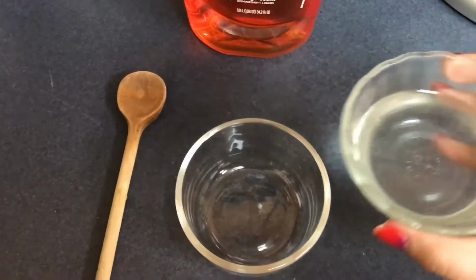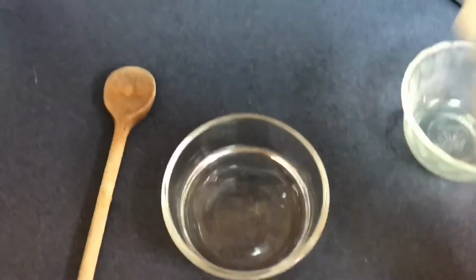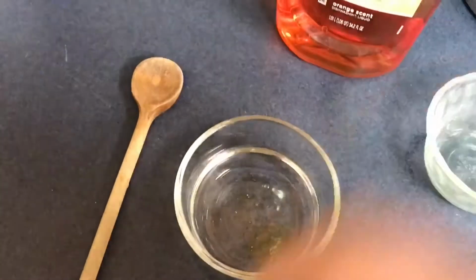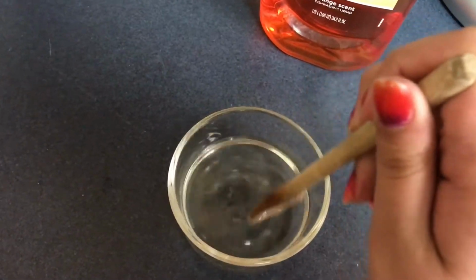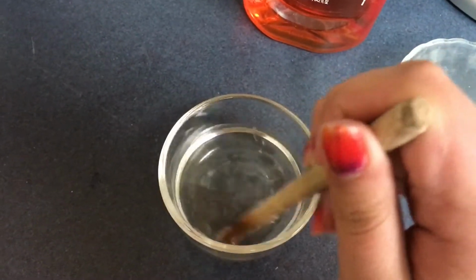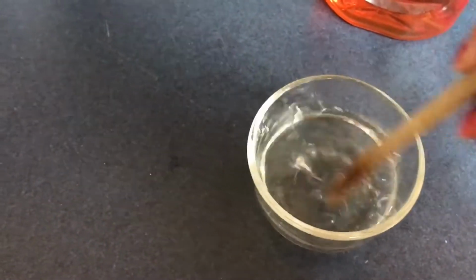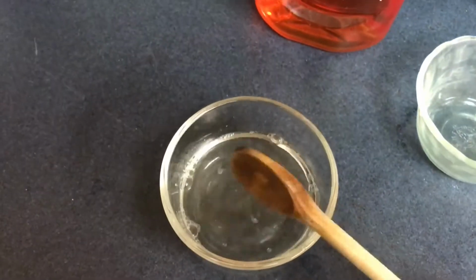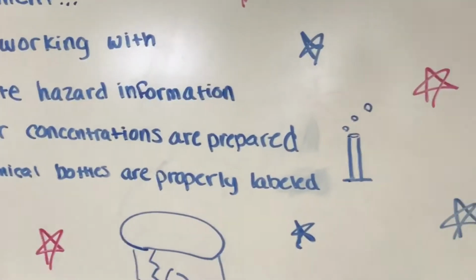As well as ensure that proper concentrations are prepared. Ensure that all chemical bottles are properly labeled.